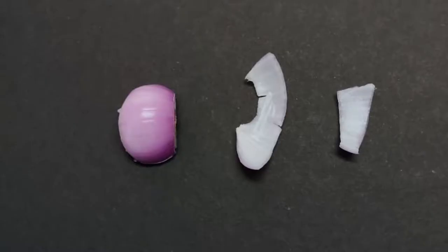Peel and cut out a long strip of onion so that the thin film-like white epidermal cell layer can be accessed.